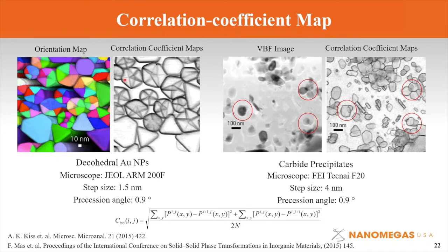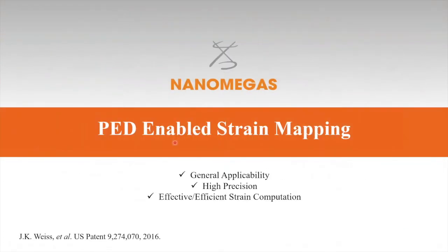Now, you may recall this is the orientation map that was sent out together with the webinar invite. So this is the orientation map of those nanoparticles. And it turns out those planes are actually twinning planes. All right, so this concludes our ASTAR orientation and phase mapping section.